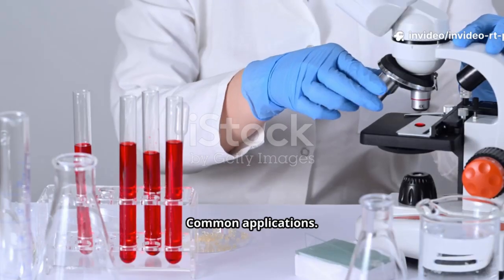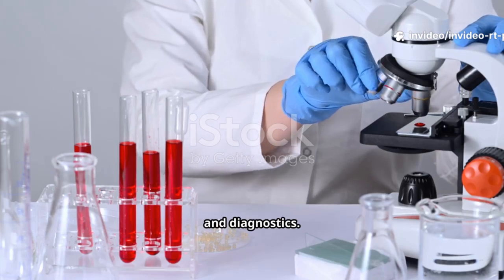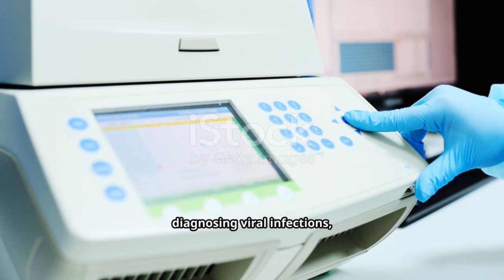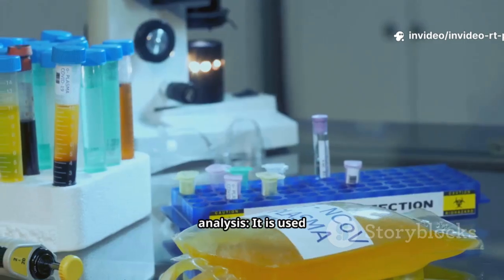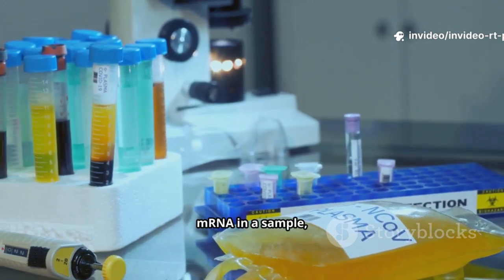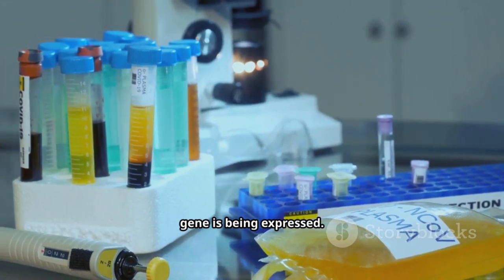Common applications. RT-PCR has numerous applications in medicine, research, and diagnostics. Viral detection. It is the gold standard for diagnosing viral infections including COVID-19, SARS-CoV-2, by detecting the virus's RNA. Gene expression analysis. It is used to quantify the amount of specific mRNA in a sample, helping researchers study how much a gene is being expressed.